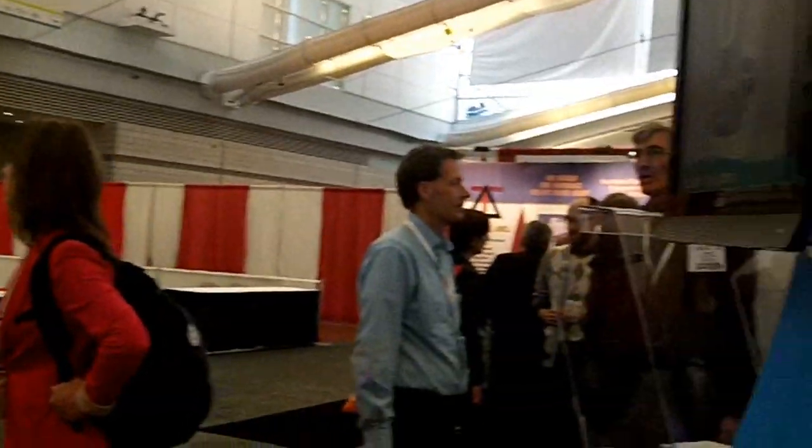We're here at the Buehler booth. Today we're lucky enough to have Andrea Johnson with us, who's going to talk about Buehler's very new mounting press, just released yesterday. So Andrea, take it away.